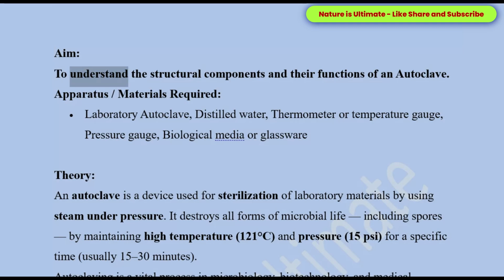Aim: To understand the structural components and their functions of an autoclave. Apparatus/materials required: laboratory autoclave, distilled water, thermometer or temperature gauge, pressure gauge, biological media or glassware.